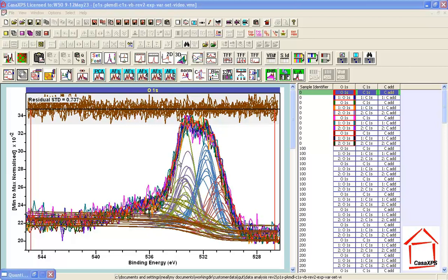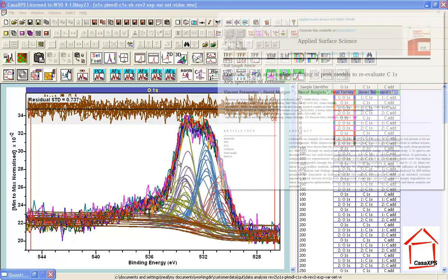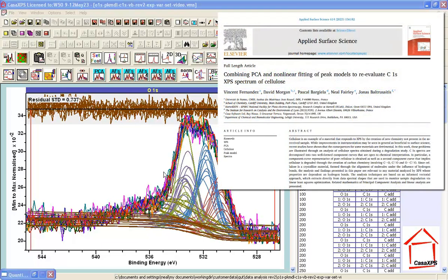The question is: is it possible to create a single peak model based on a set of data such as these? The answer is yes. We can fit these data using a strategy that involves fitting all the data to a single peak model simultaneously. If that single peak model applies to all the data, it would be a step towards producing a meaningful peak model in terms of chemistry and physics.